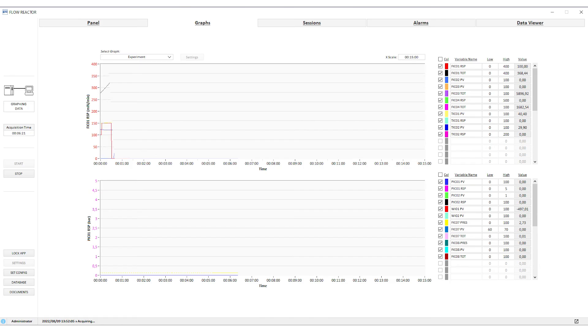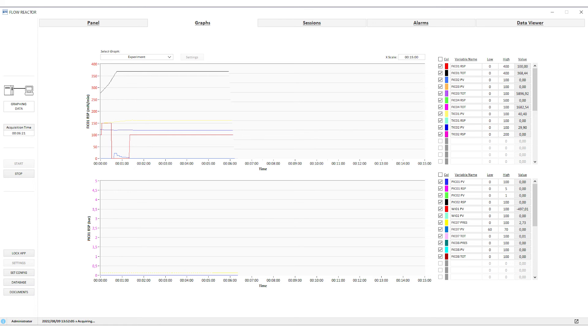All reaction variables and the amount of product produced can be viewed in real time and saved for further analysis.